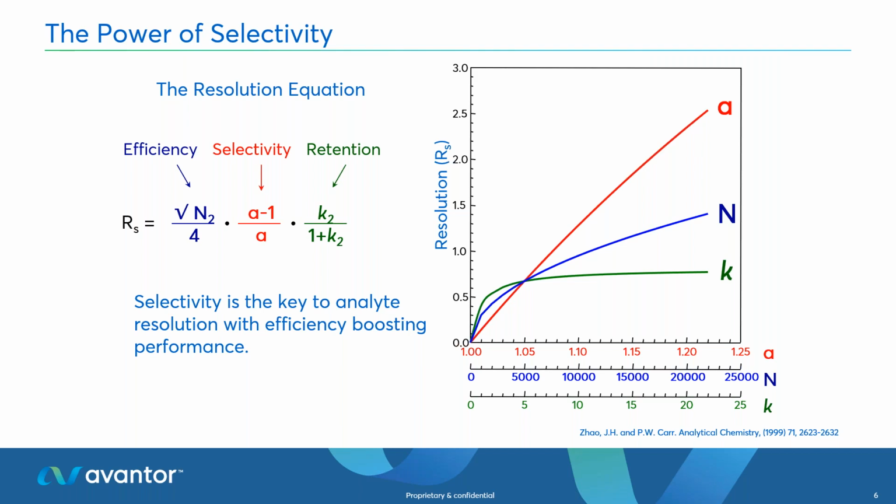So if we don't have a consistent mobile phase, you can see our peaks could be moving around. And that is not good for QC work. It's not good for the same method each day. It's not even good for our method development, because we want to get the same result each time when we're running the same method. So consistency is a key factor.